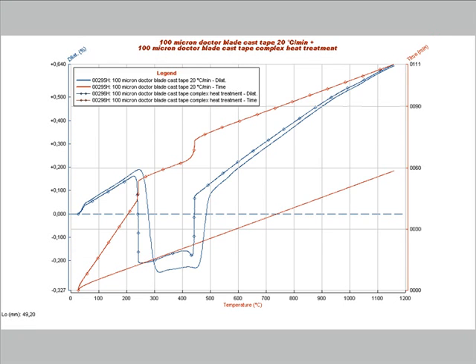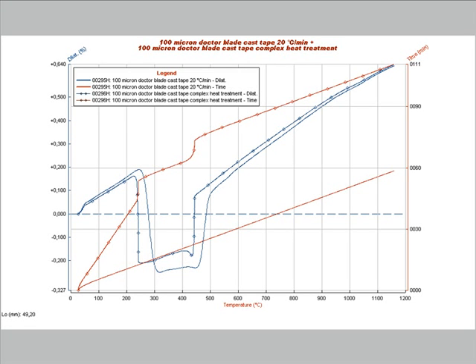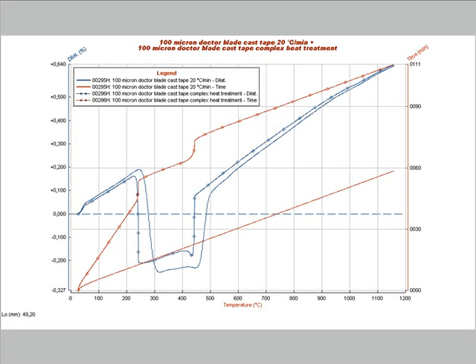Looking at the previous results, with the temperature on the x-axis, we can easily draw the conclusion that these sharp volume changes cannot be eliminated working with the heat treatment, slowing down the heating or introducing intervals at constant temperature. This type of analysis is possible only using this kind of instrument, thanks to the fact that the measurement is absolute, and it is possible to change the heating rate during the test.